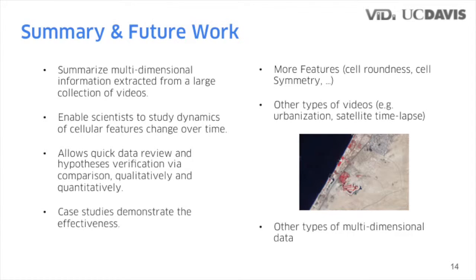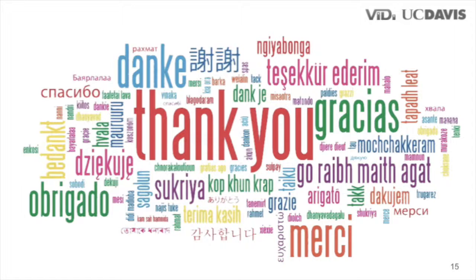And this work can be potentially extended to visualize other types of videos or other types of multidimensional data for comparison studies. Thank you for all your attention.